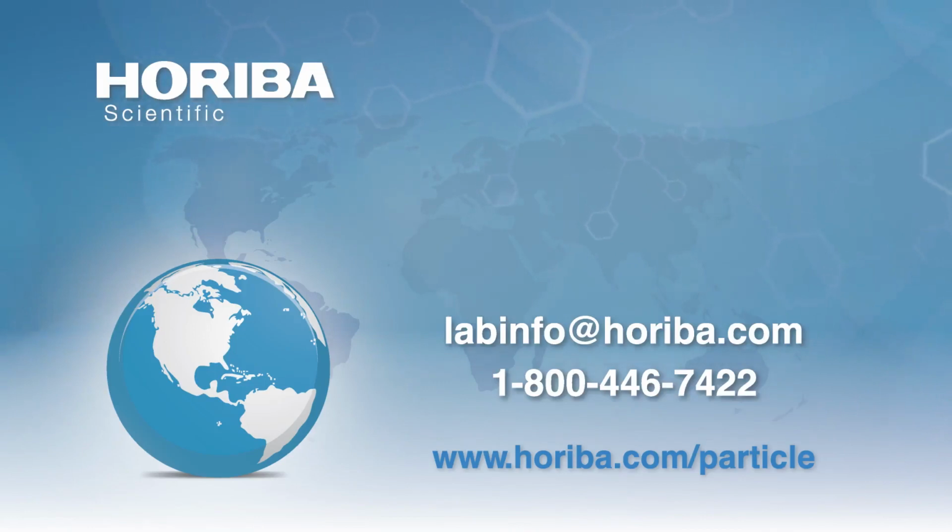Years ago I worked with a company called British Titan Products, which eventually became Tioxide. I was shown that when they made up suspensions of titanium dioxide to measure zeta potential, they made a slurry at constant concentration, because the chemical equilibrium changes with concentration of particles.